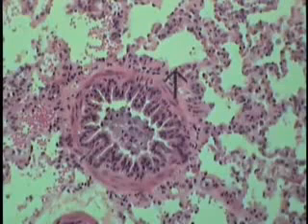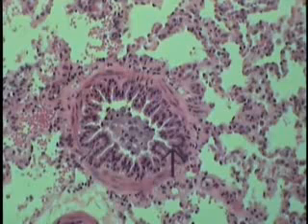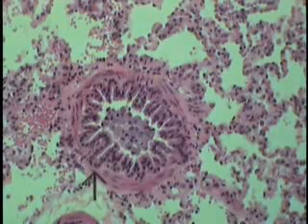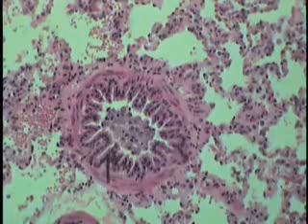An additional section through a bronchiole that's cut perhaps a little more crisply and more of a perfect cross section. It illustrates quite a bit better the bronchial smooth muscle, how it forms a complete spiral around and forms the supporting wall of this particular portion of the conducting system of the airway, as well as the folded nature of the epithelium, which even at this intermediate power, one can see as a simple columnar form.